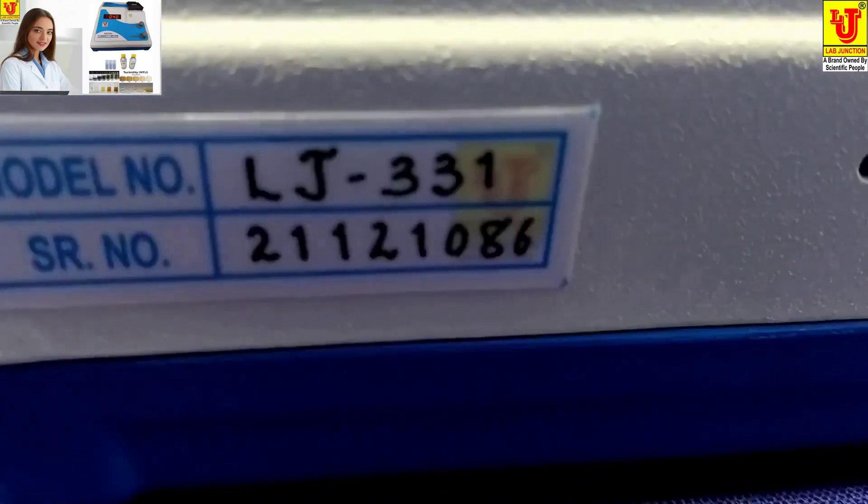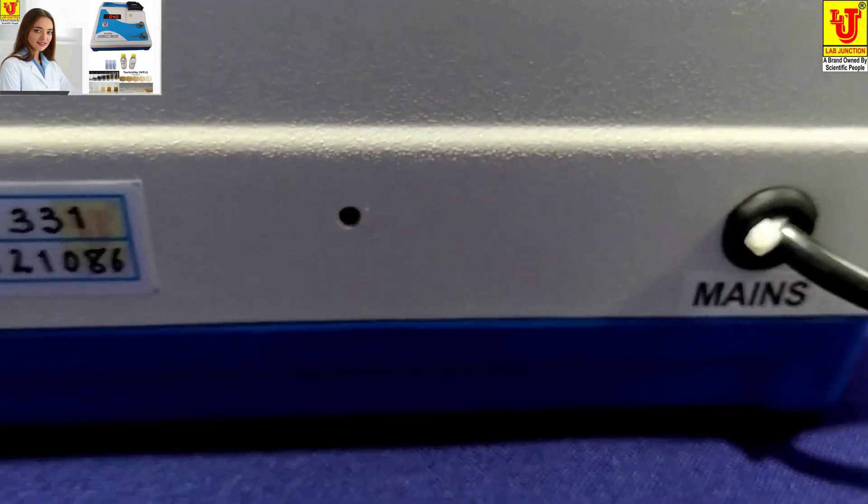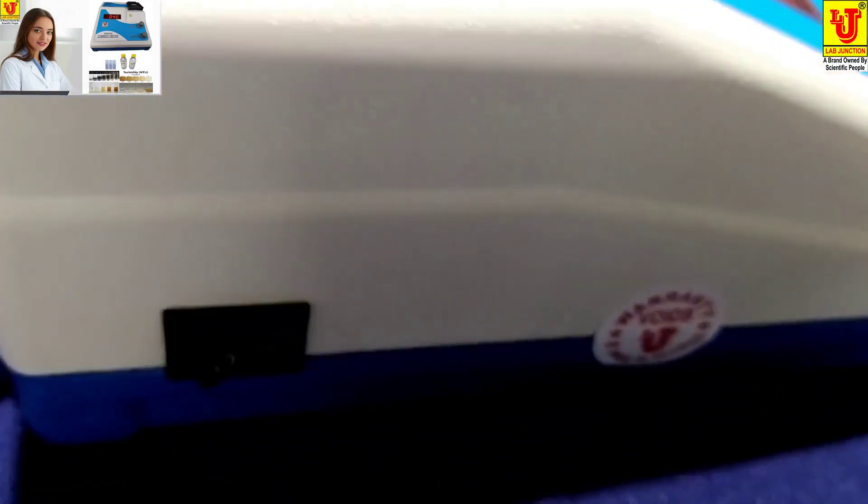Back view — in the back view, only the main cord is available. Again, side view — in this side view, the on-off control is available.